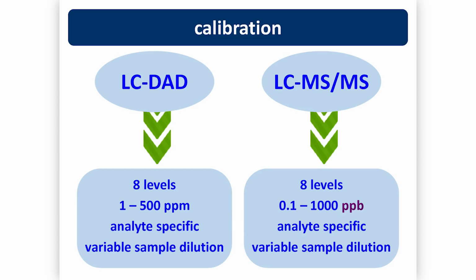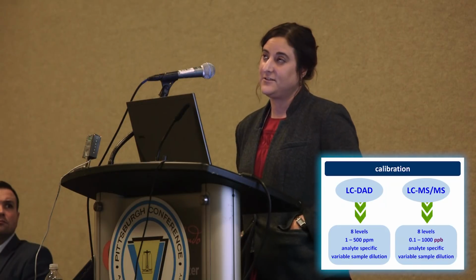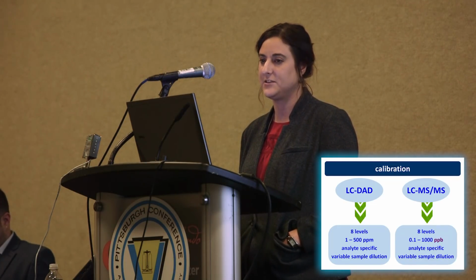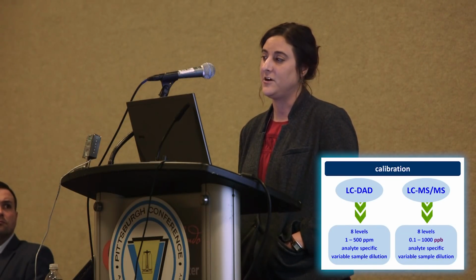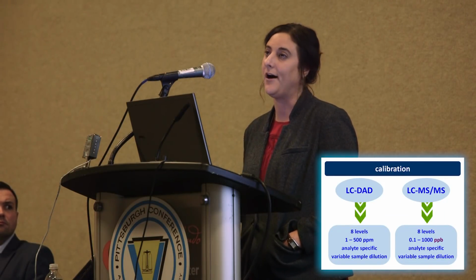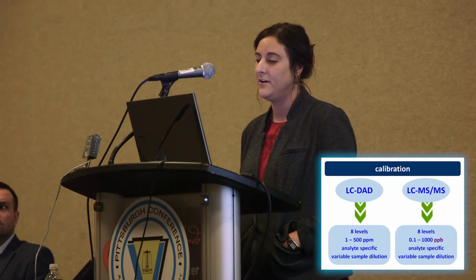So for calibration, LC-DAD, 8 levels, 1 to 500 ppm. This is somewhat analyte specific, so sample dilution sometimes has to be variable just to get things in range, because again, you're talking about 0.1% by weight to potentially 100% weight, and so the range is quite wide.